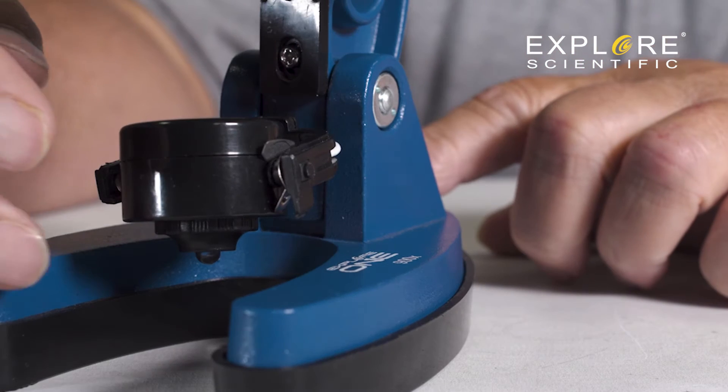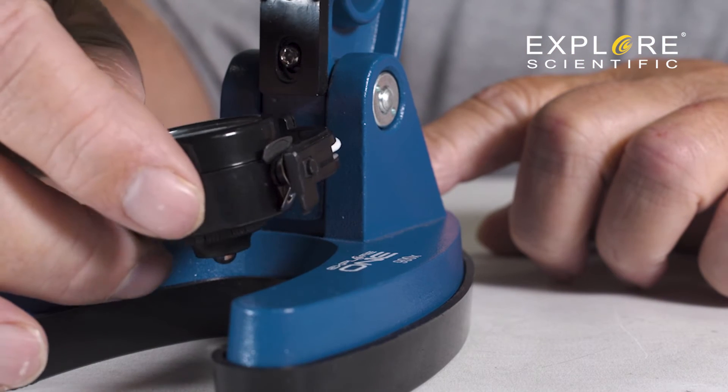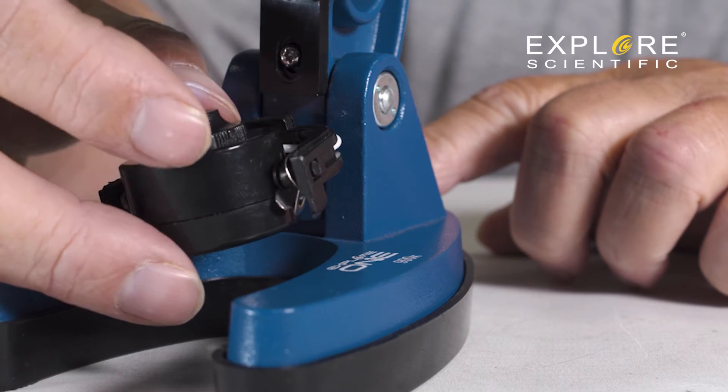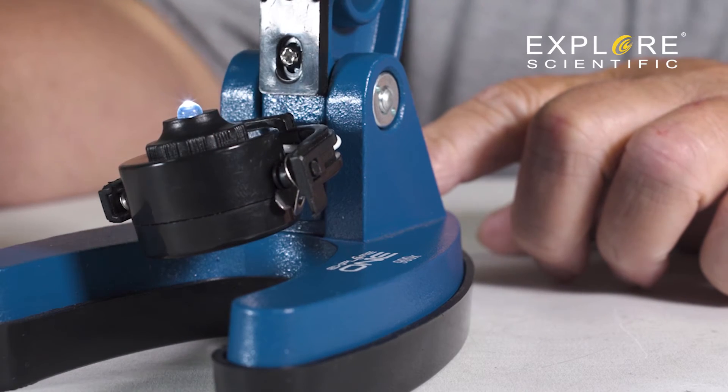On the right side of the light assembly is a metal tab. When the light is rotated, the tab touches the contact point, completing the circuit so power flows through the light.